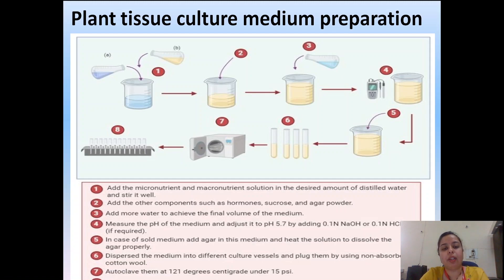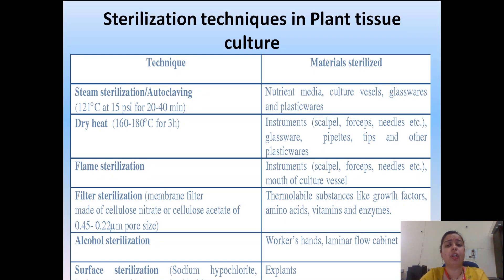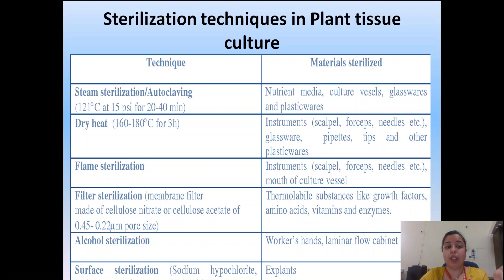After sterilization, the medium is taken out, allowed to cool down, and then used for the further process. So an important step of plant tissue culture medium preparation is finished. The next step is sterilization, which is again a critically important step in the plant tissue culture process.